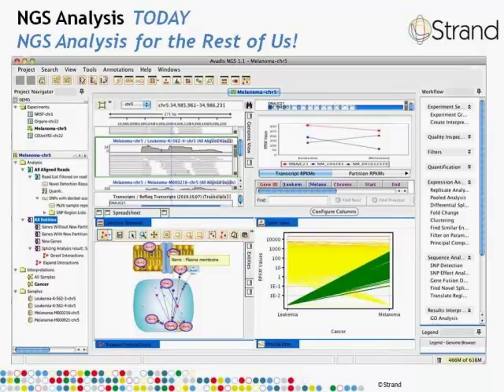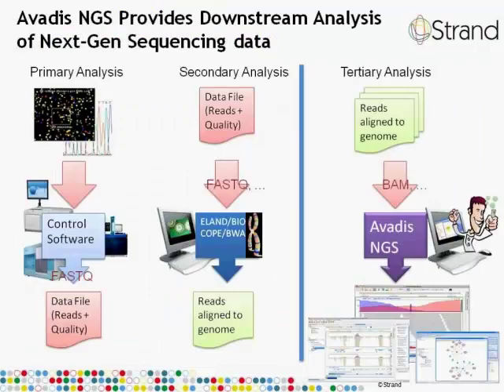In the next few minutes, I would like to show you how the product works and is useful particularly in looking at sequence data from various cancers, and how it can help you answer real biological questions without having to be an expert bioinformatician.